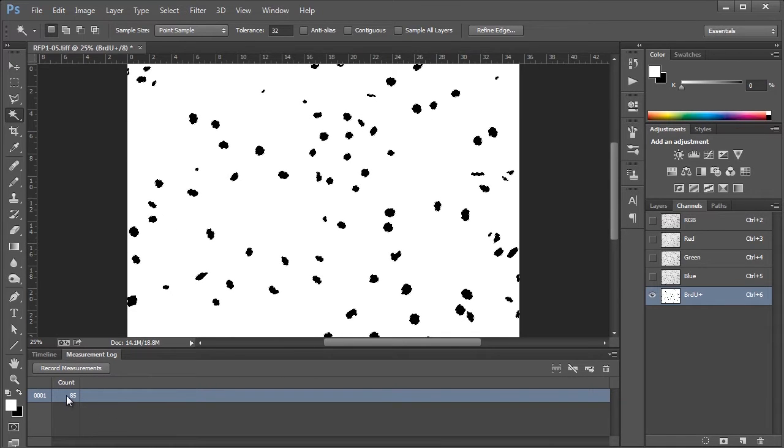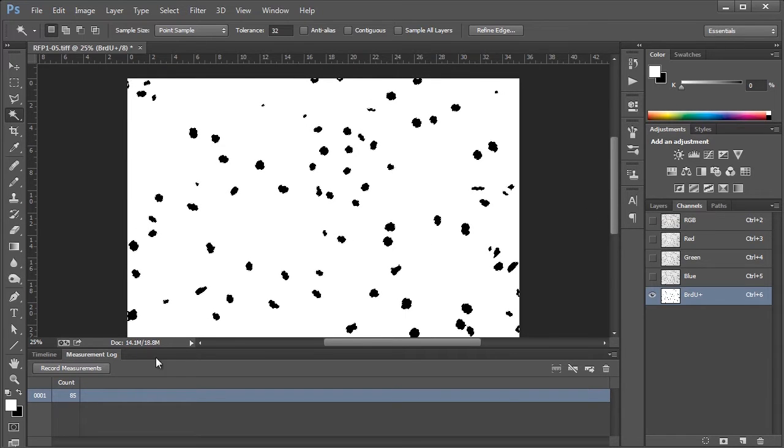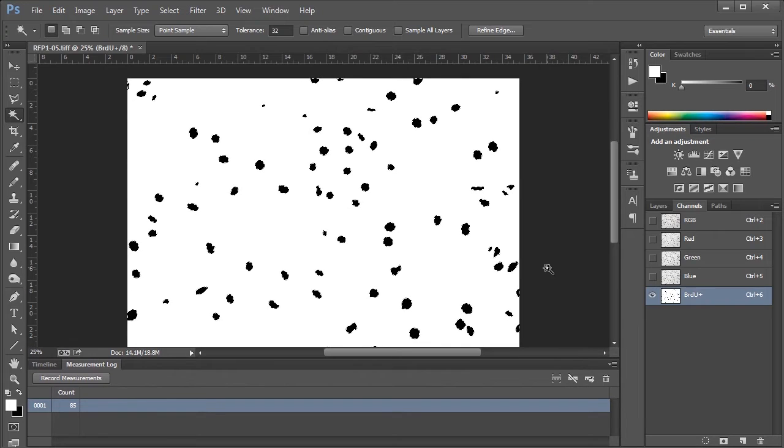It's a little different than what I had before because I spent a little less time refining my image today, but it should do for now, and when you're doing it you'll spend a little more time, I think, to make sure that everything's in the right place.